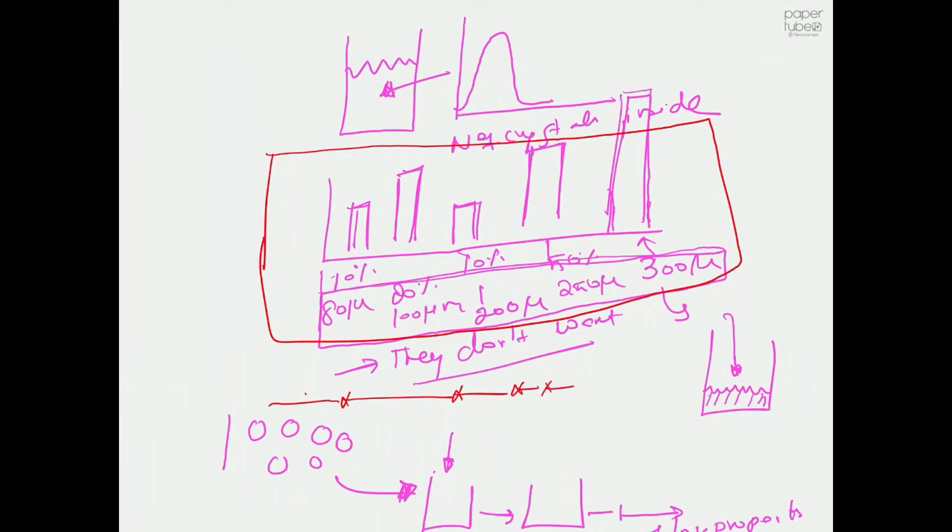So if you are going to crystallize a compound, you should know what the benefit of nucleation is, what the benefit of growing the crystal is, and when to go for nucleation and when to go for normal crystal growth. So how to identify the best conditions where we can eliminate nucleation?